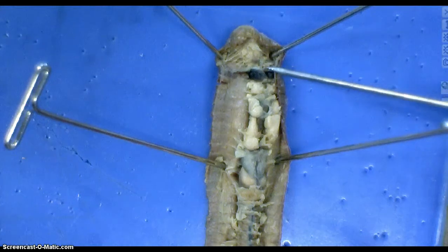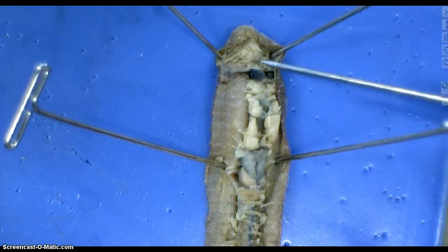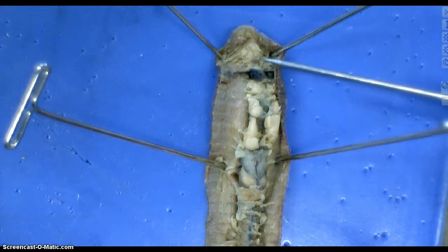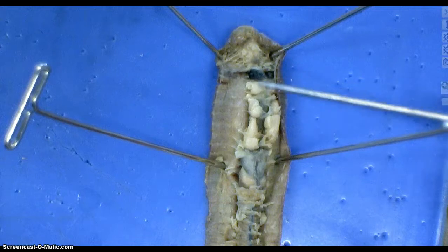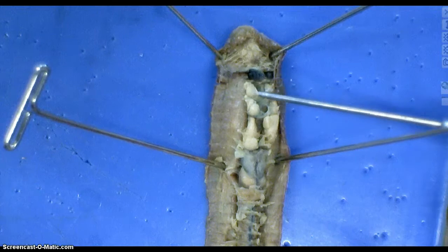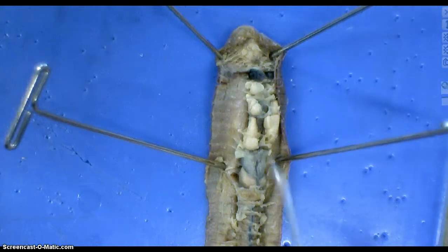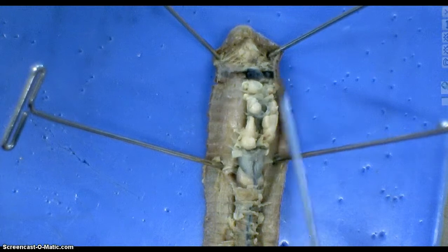Underneath here there's a very thin structure. Depending on how talented you are, you'll be able to pull out the esophagus, which is underneath all of these structures here. Some groups do that really well; sometimes you have to use theirs as the example. I'm trying not to cut into this one too much so that you guys have something to look forward to.